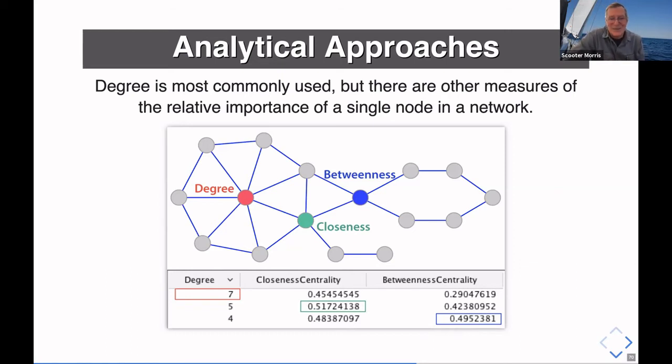And the other thing that we've already talked about briefly is enrichment, and saying, is this gene enriched in a set of terms vis-a-vis some sort of background? So feel free to go through these slides. If you hit the down arrow, there's a number of different slides here that go into a lot more depth and give you the actual calculations for all of these, but I'm going to skip that.